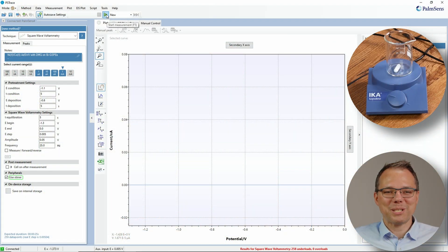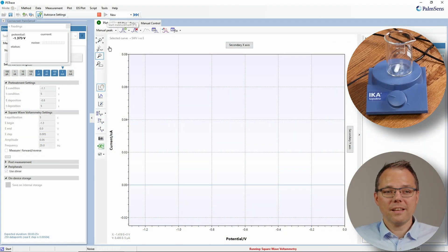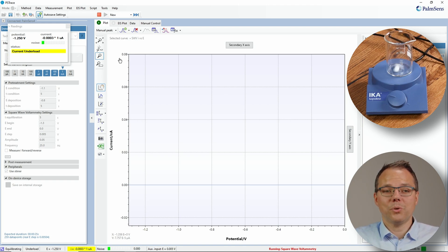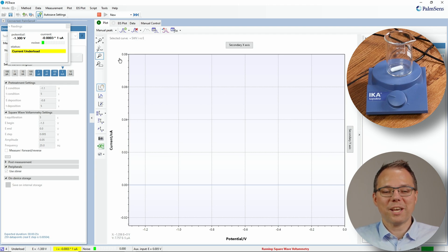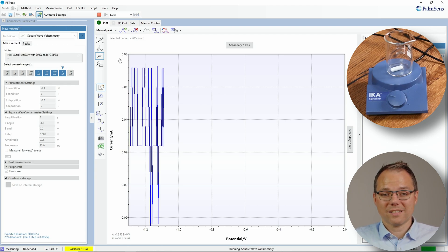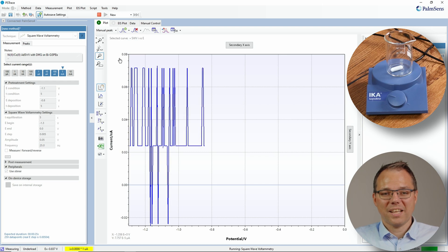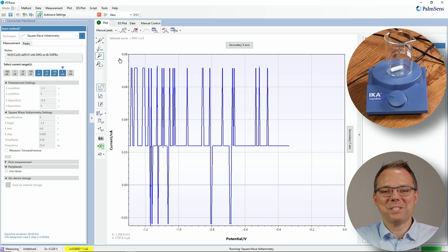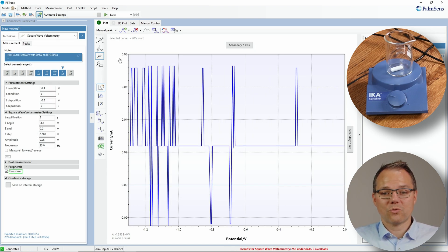Let's look at how the measurement looks. I start the measurement, the stirrer switches on, and as set, the two conditioning and deposition potentials are applied for five seconds each. After 10 seconds the stirrer stops, then there's a five-second equilibration time before the measurement starts. Of course I'm just measuring noise here since I have not connected any electrodes to the potentiostat — this is purely a software demonstration.